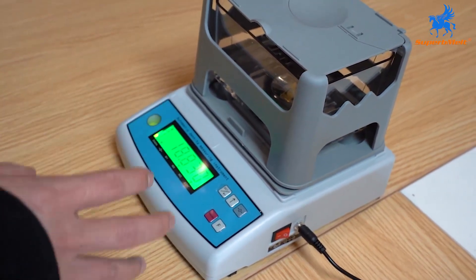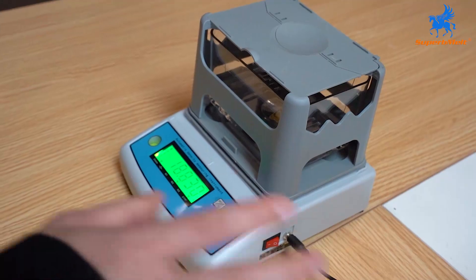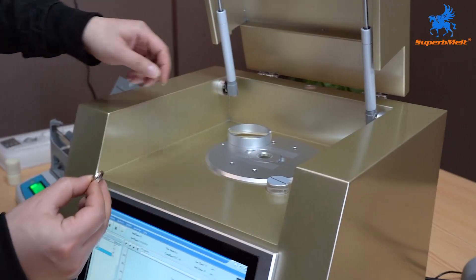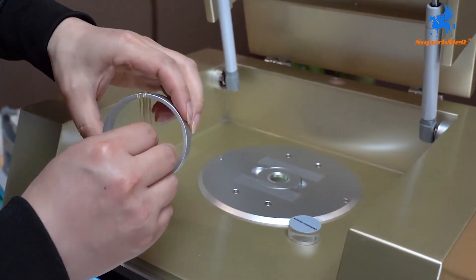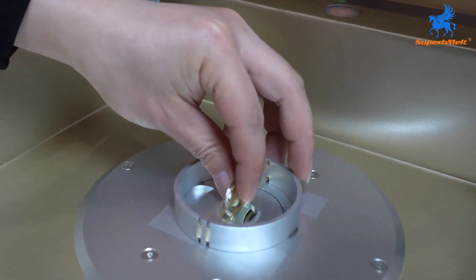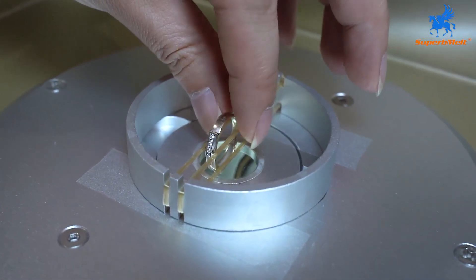So following this, we need to use the analyzers to check again. Now we check using this XRA 1200 model. This is an 18-karat ring — let's see the results.